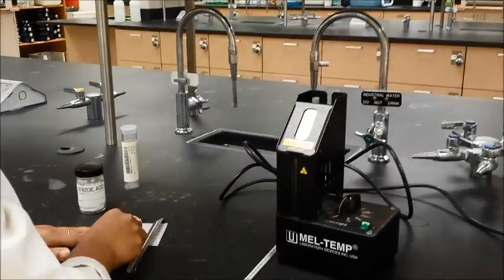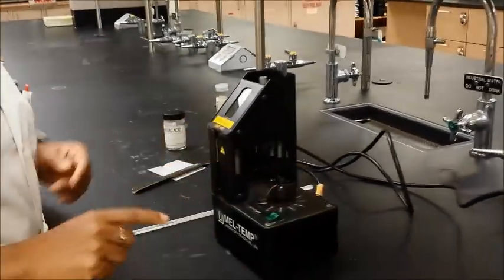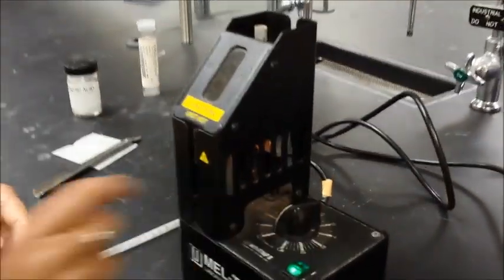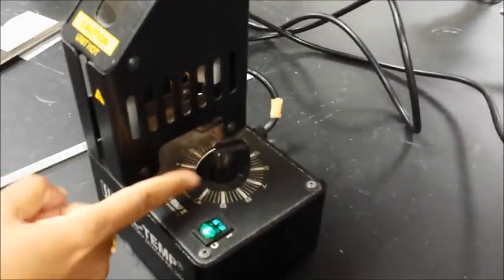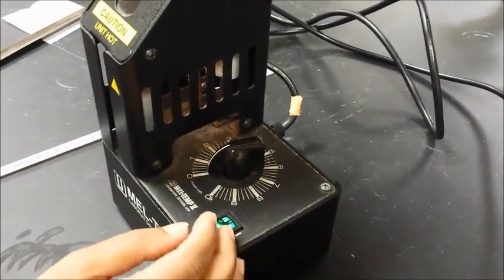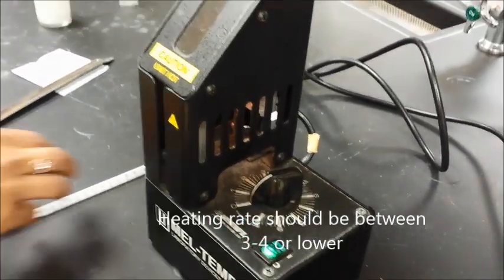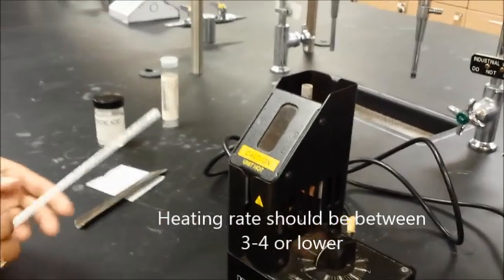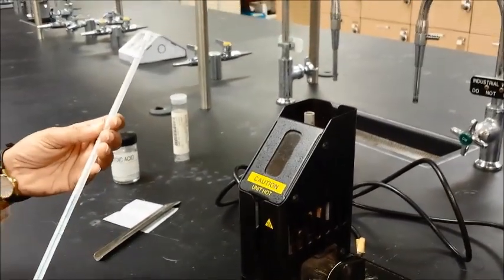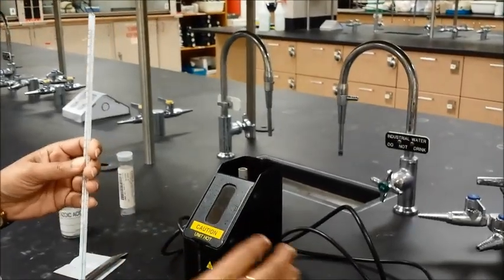Now to get your melt temp apparatus set up, what you'll have to do is plug it in of course. And this is the on button for it, this is the on switch. Right here is the heating control, so you can control the heating rate from 0 to 10. But you want to keep the heating rate to about 3 or 4. Most of the organic compounds will melt below 300, so you don't want it to be a very high heating rate. You want to actually observe the melting point, so you want to keep the heating rate to about 3 or 4.